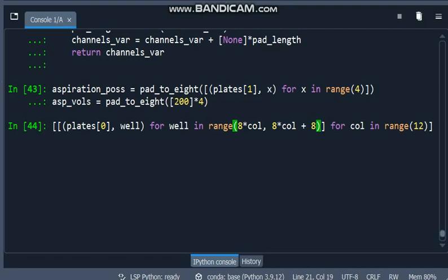Now that we have our whole plate dispense pattern, we have to convert this to our checkerboard dispense pattern. The first thing we'll note is that a checkerboard dispense pattern implies that we're going to be targeting every other well in a column for a dispense. The way that we apply this to a list comprehension is pretty straightforward. We just need to insert a conditional statement at the end of the inner list comprehension that filters out every other well from being dispensed to. That'll look like this.